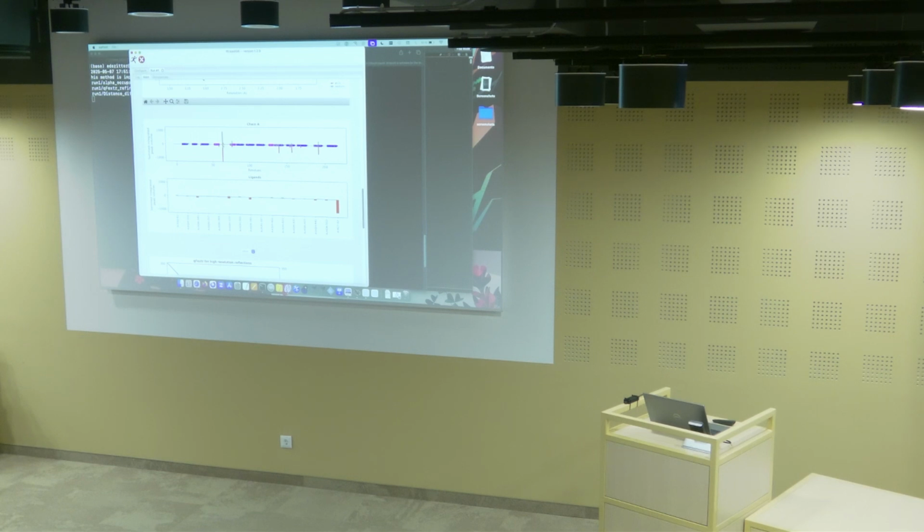Without looking into Coot or any other program to visualize the map, I can already see that I have peaks on specific locations. For example, in the ligand section here, I can find waters, but this is also the code of my chromophore, so I can find a very large peak on that chromophore. This gives me an overview that I have peaks on specific locations, which is basically what I want. I don't want to have peaks all over the unit cell, because that would just mean noise. So when I see this, I'm already getting excited that I have good maps.